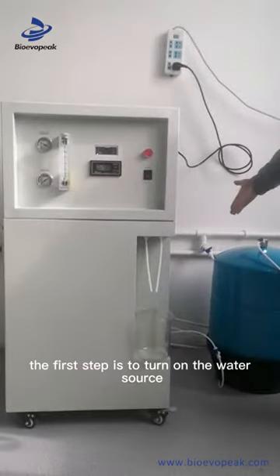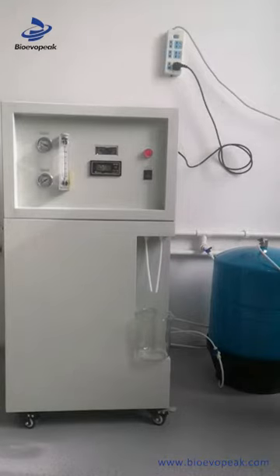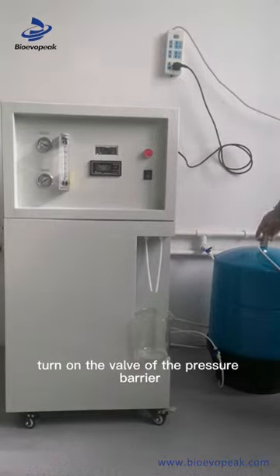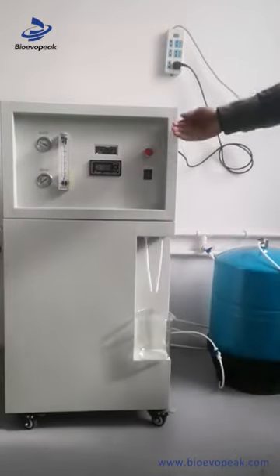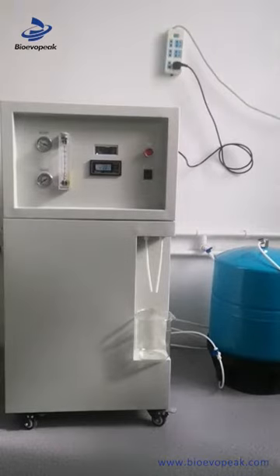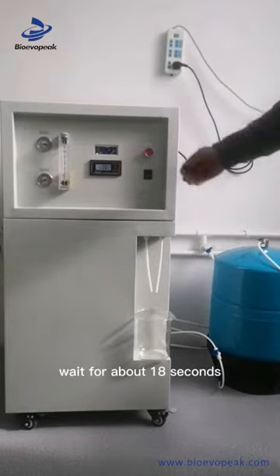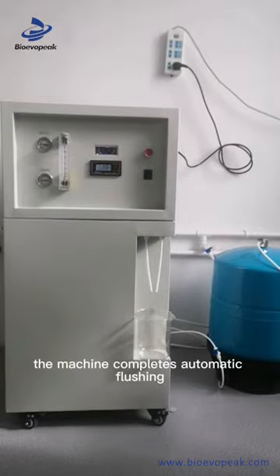The first step is to turn on the water source and turn on the power. Turn on the valve of the pressure barrier. Press the power switch. Wait for about 18 seconds. The machine completes automatic flushing.